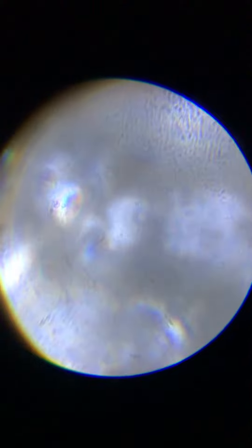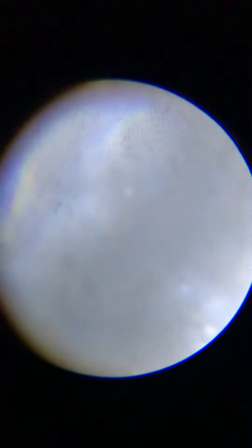I will be able to make lots of cool microscope videos. Suggest what you want me to microscope. This is what happens if I put it in all the way — you can kind of see the germs in the background, I don't know what those are. Oh wait, no guys — my camera fell. That was actually just 10x.